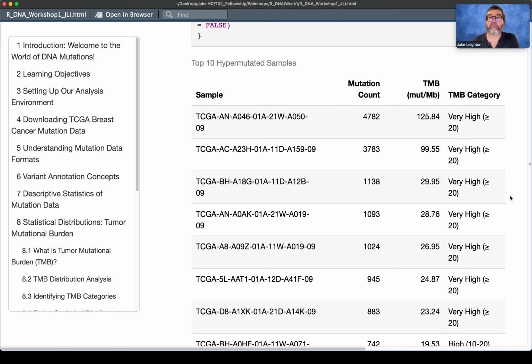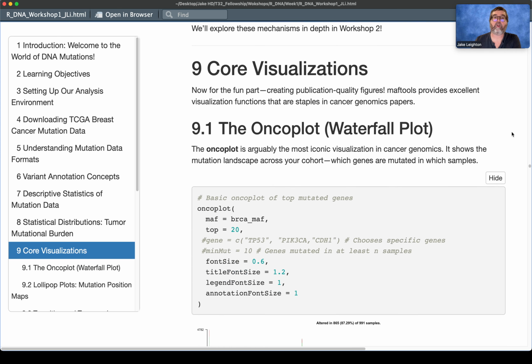And all I'm doing is data wrangling. I'm not doing any analysis besides calculating the TMB by dividing by 38. Everything else is in that graph file. We're just reorganizing this to get a better idea of what we see.